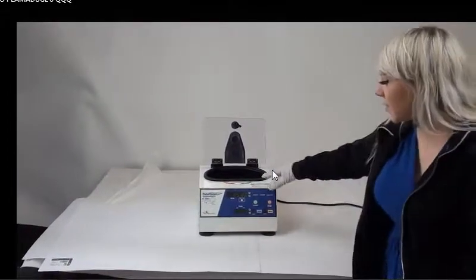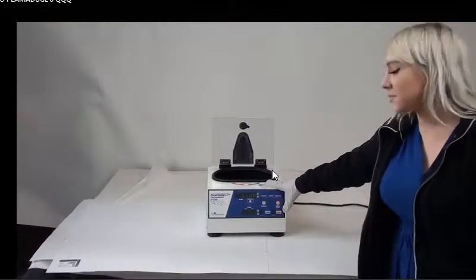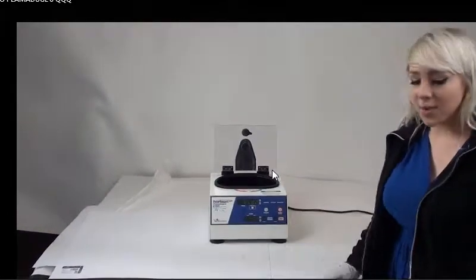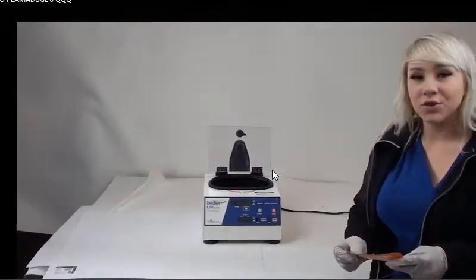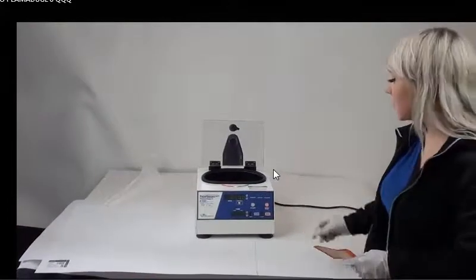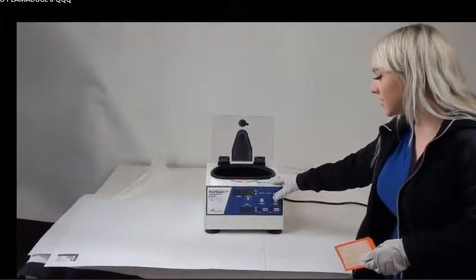MyCyberOffice. Today we're going to be testing out and showing you how the Horizon PlasmaFuge 6 works. Today we have the model 842VES. It is part of Drucker Diagnostics.